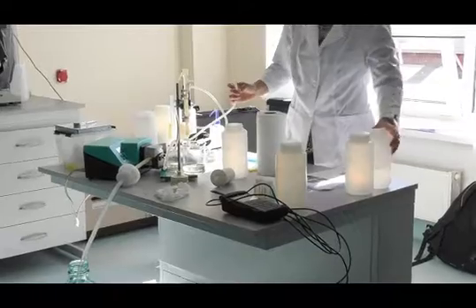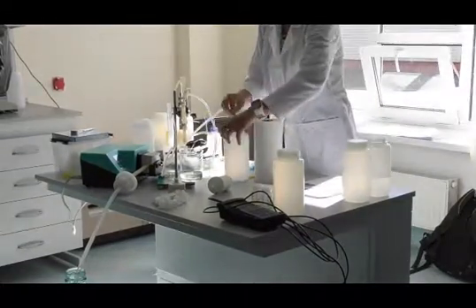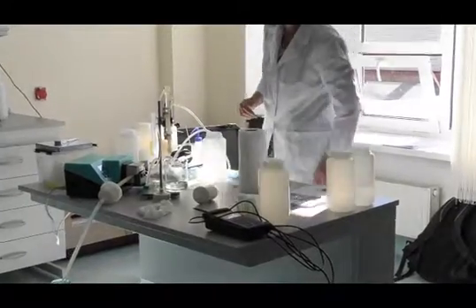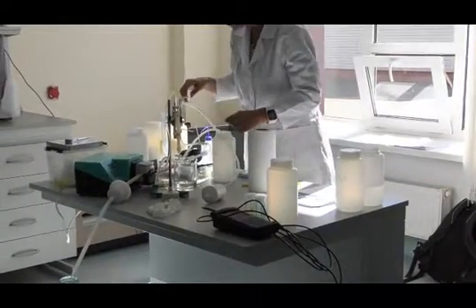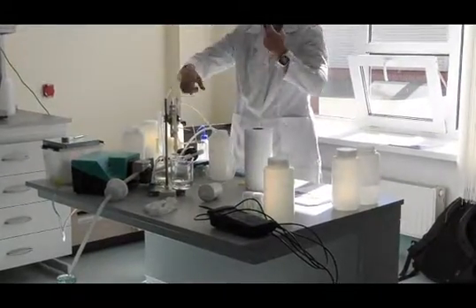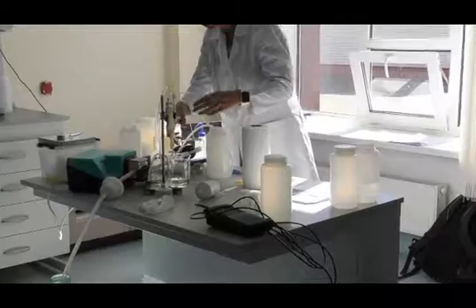So when we have collected the 0.45 fraction, we would like to start with the ultrafiltration. You saw that a lot of sample was pumped through at a time.